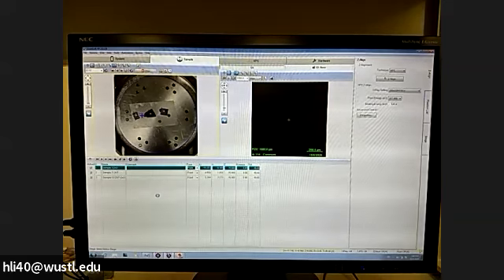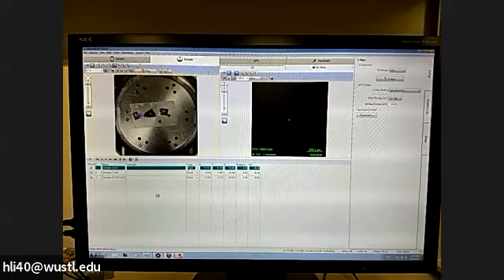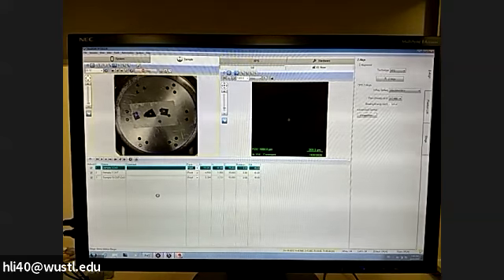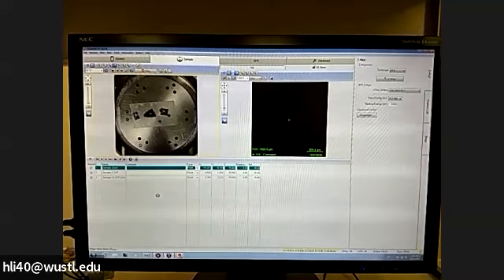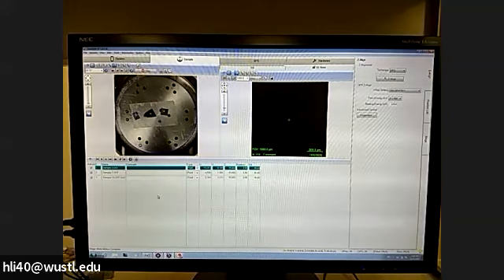If you're familiar with this part, what I'm going to show you, if you only have 1 sample, I would like you to pay a little bit of attention. If you have 1 sample, it's okay. But if you have 10 samples or 15 samples, you maybe want to use another method.